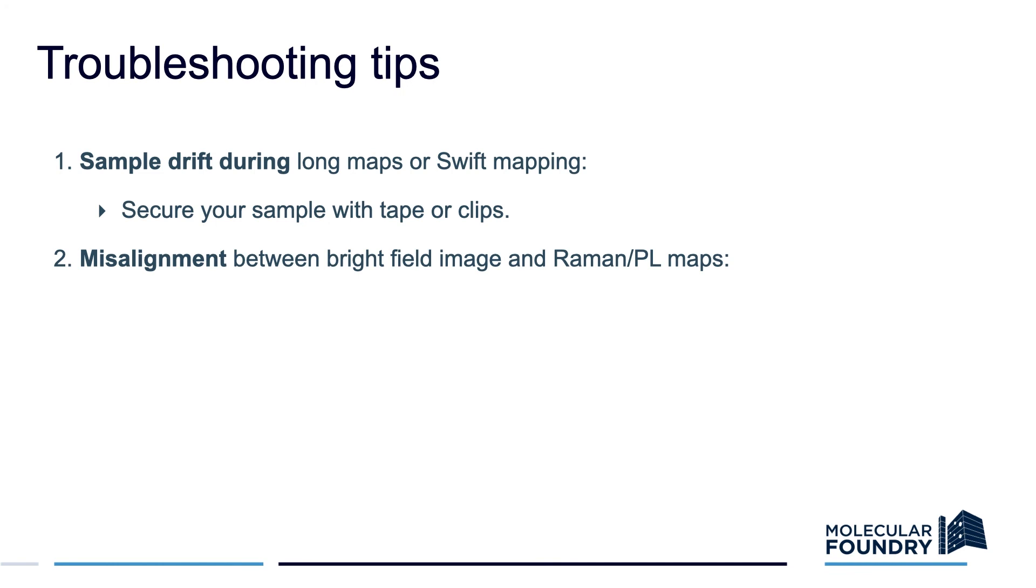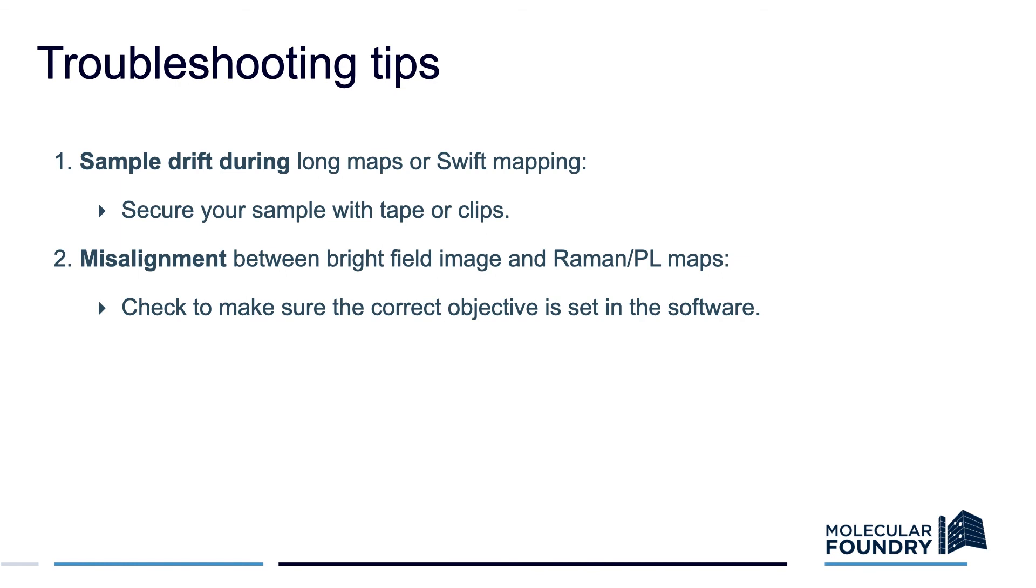If you see misalignment between the brightfield image and the Raman or PL maps, check to make sure that you have set the correct objective in the software since that sets the calibration of the stage.